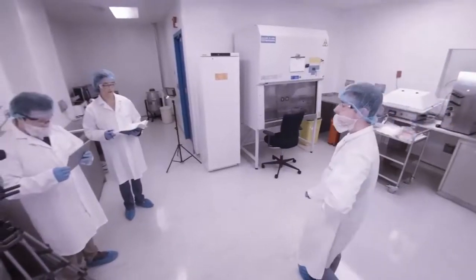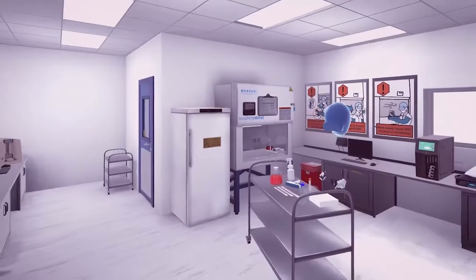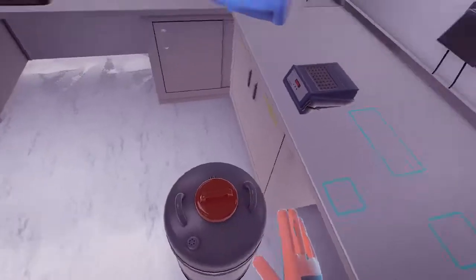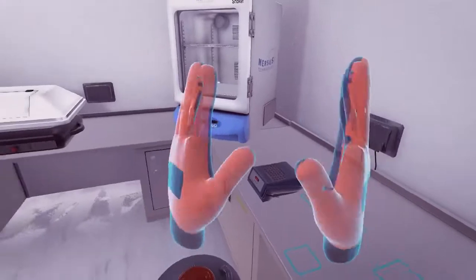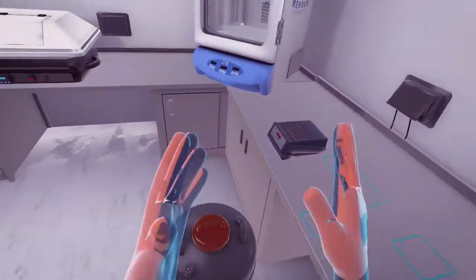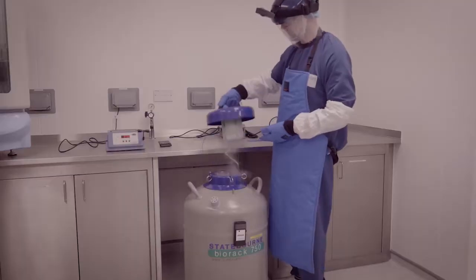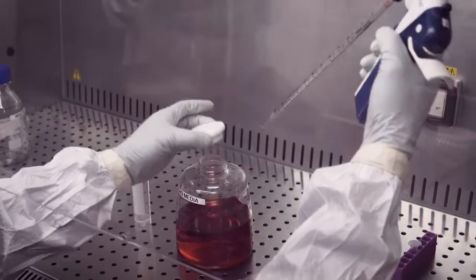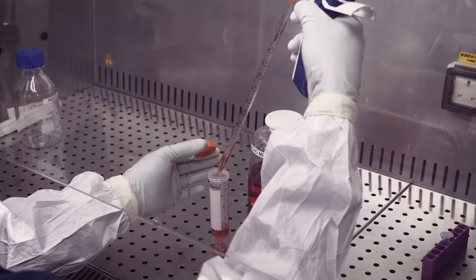The team have digitally recreated a real-world inoculum room, keeping proportions, equipment and lighting as close to reality as possible, whilst maintaining high levels of performance for smooth operation. To accurately recreate real-world training practices, reference material was captured of the environment, nuanced movement and correct protocol.